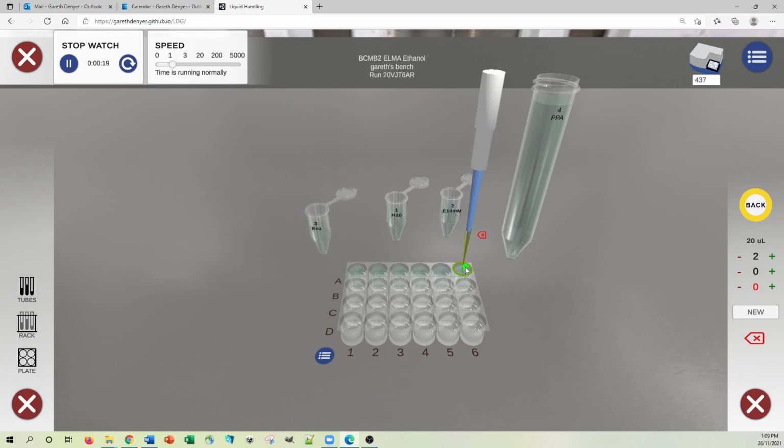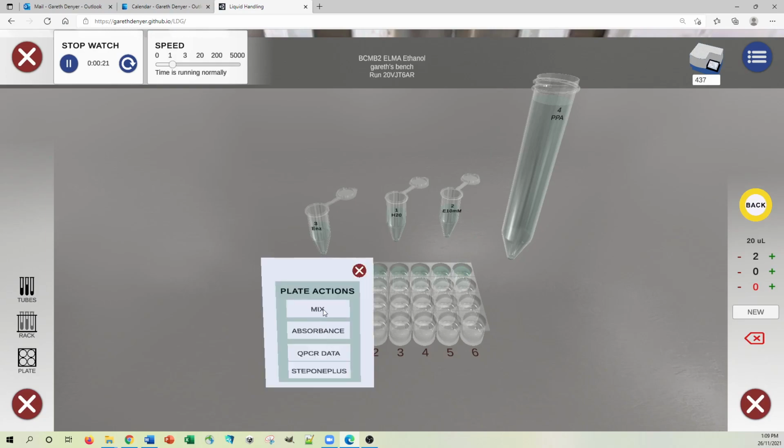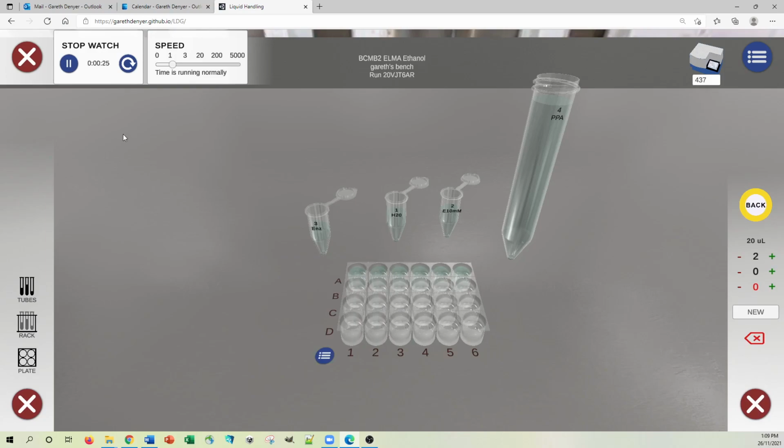And they are all going. So let's mix them again. And this reaction is going to take about 30 minutes or so. And of course, we haven't got that long, so I'm just going to dilate time a bit. So let's get time whizzing up a bit. So I've just set it to going about 30 times normal time.